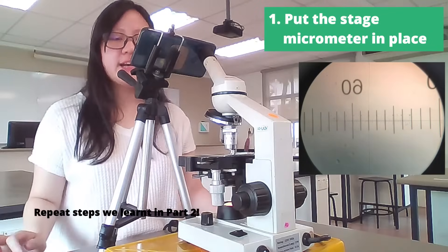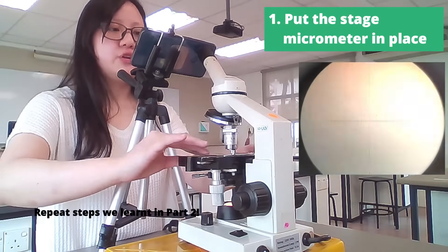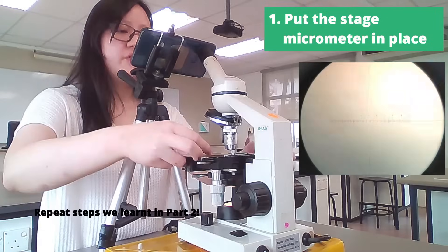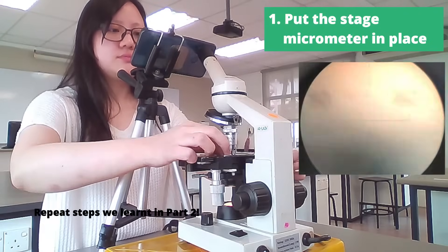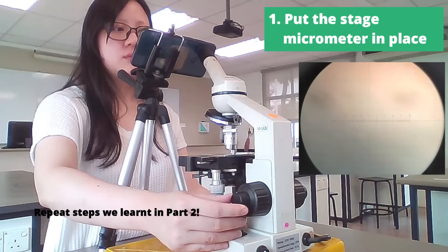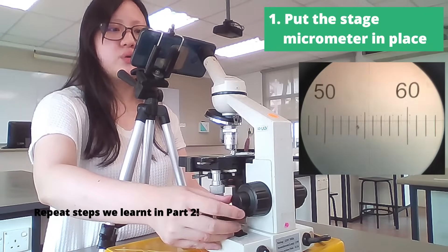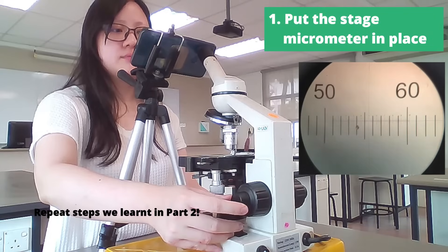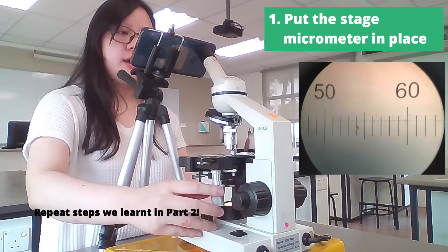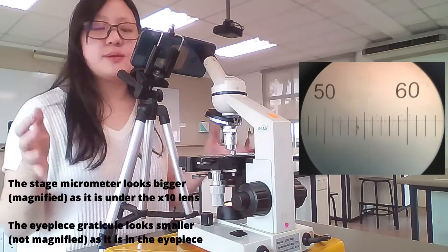If you realize that your stage micrometer has been placed in the wrong direction, feel free to take it off, flip it over, and put it back on. You might need to focus it a little bit again using the fine focus knob. And this is the stage micrometer in focus at 10 times magnification.